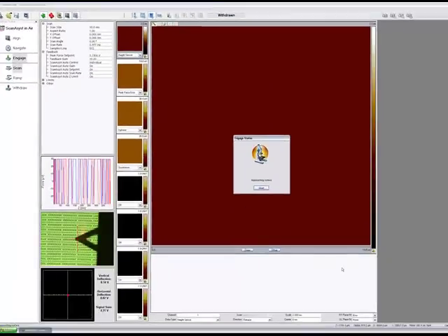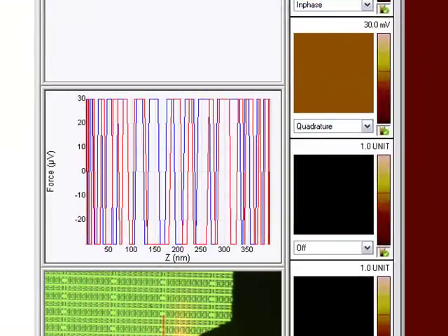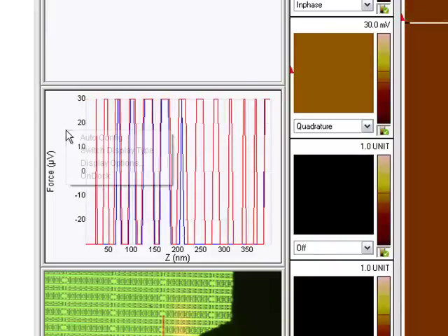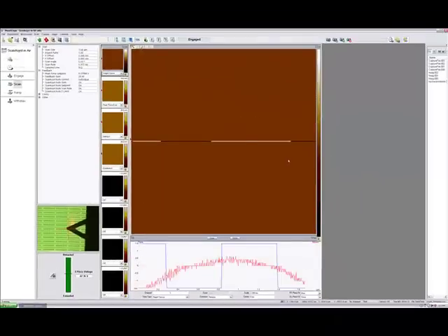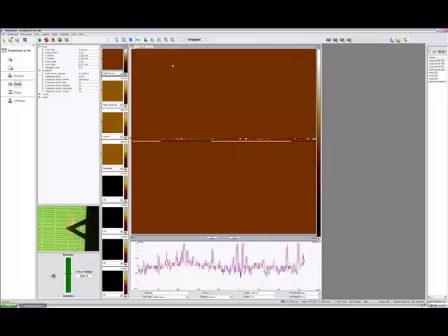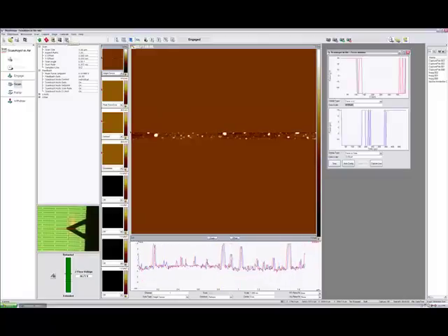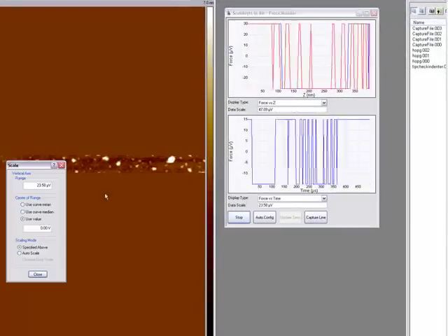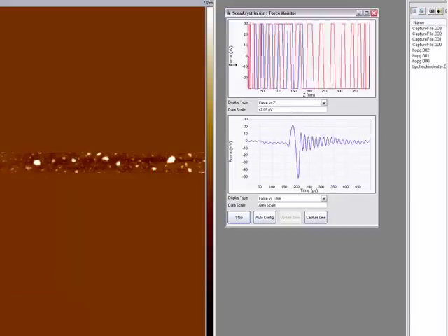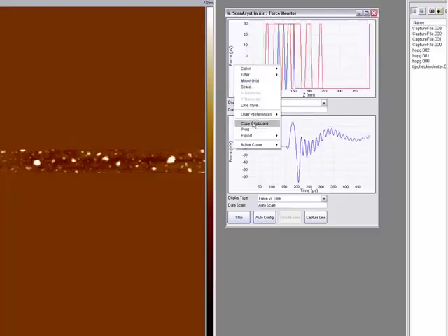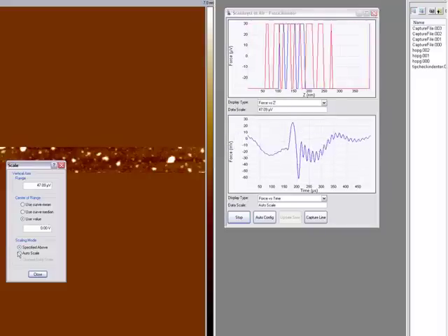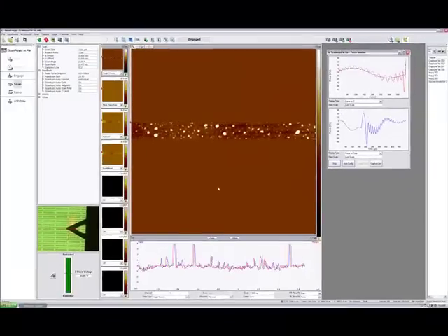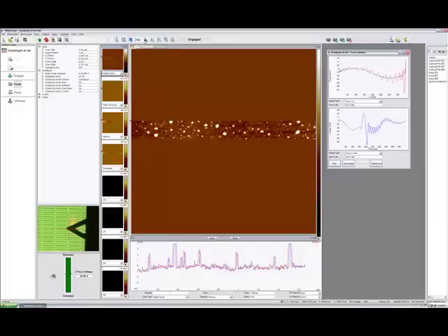If you want to change parameters, you can set the ScanAssist parameter settings to Individual, and then you have the option of changing any parameter. For the force window, we want to undock it by right-clicking on the window and selecting the Undock option. It can sometimes happen that the window disappears in the back — just get it back by clicking on the main menu bar. Now we want to select Force versus Z in the top window and Force versus Time in the bottom window, and auto-scale both windows. Auto-scaling of images is also a new feature in software version 8.10.